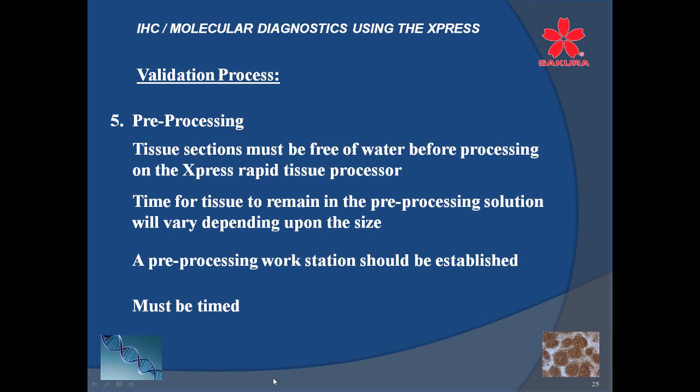fixation. And then pre-processing, I can't emphasize this enough, your sections must be free of water before processing on the Xpress, or for any rapid processor for that matter. Then the time for the tissue to remain in this pre-processing solution will vary upon the size. Biopsies do not require very long.